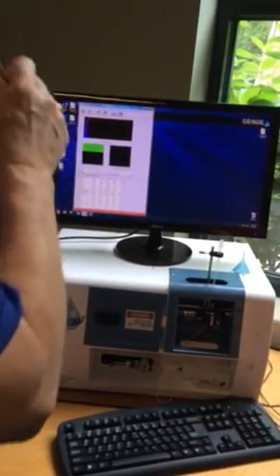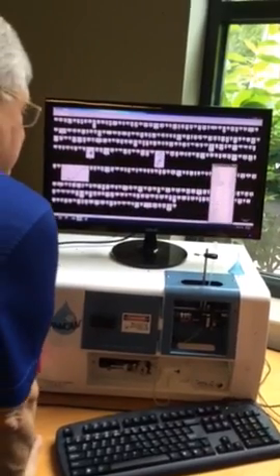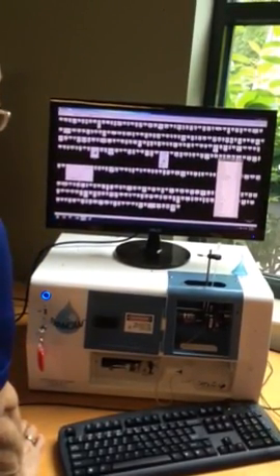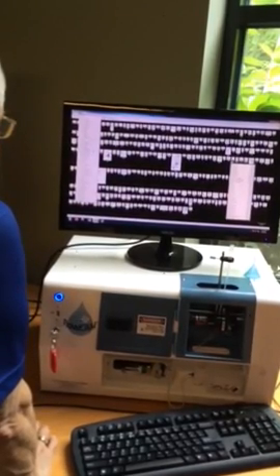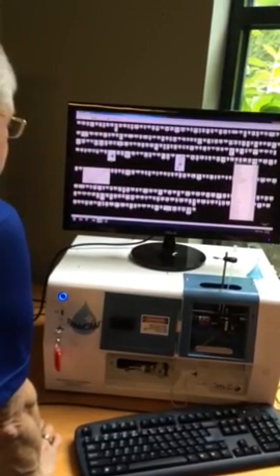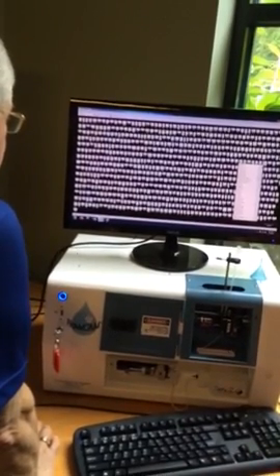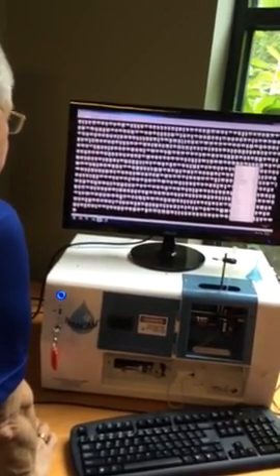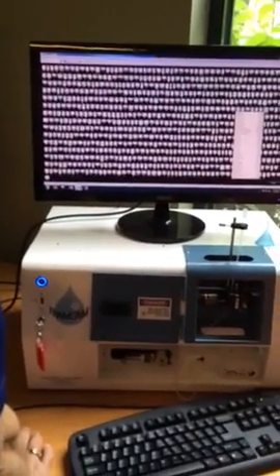Let's show all and just check it out. See what we have at 4x. So I'm going to sort the data by size. Really little guys up front. I can either hit this up arrow in reverse, or I can hit this arrow with the end point and go to the last page. Doesn't matter.